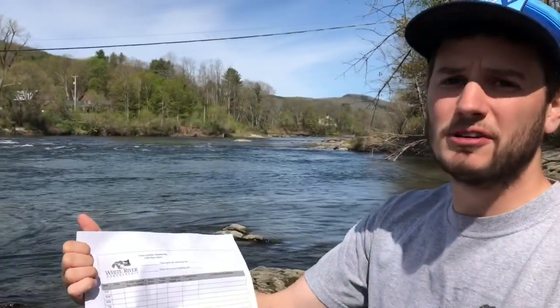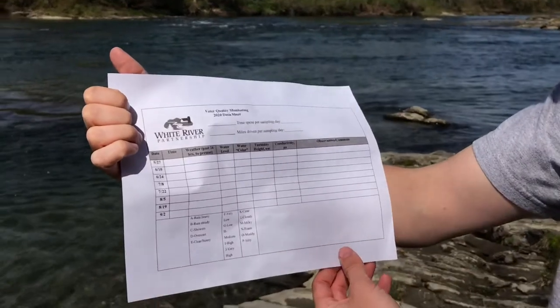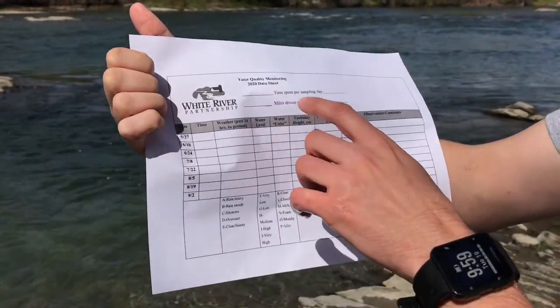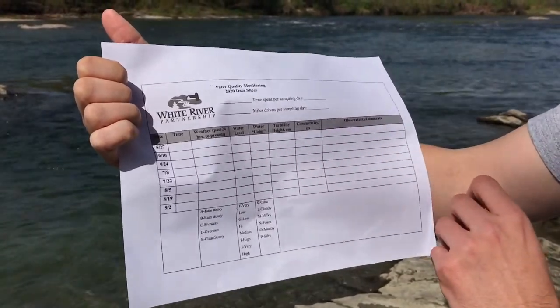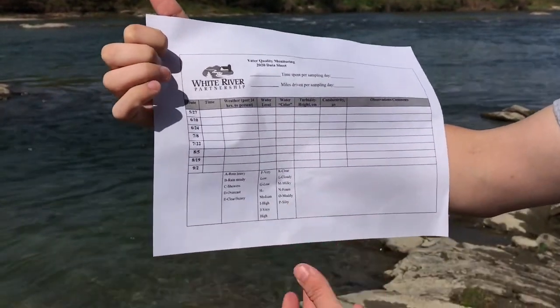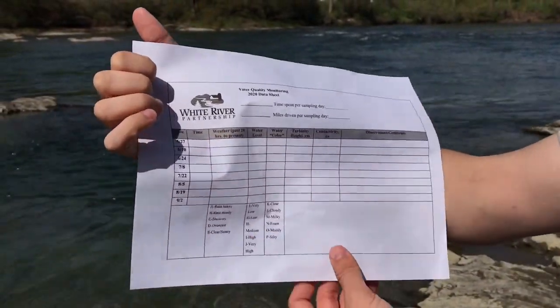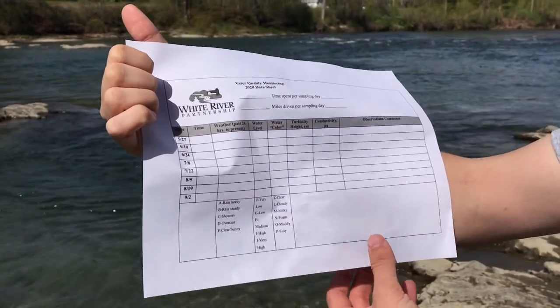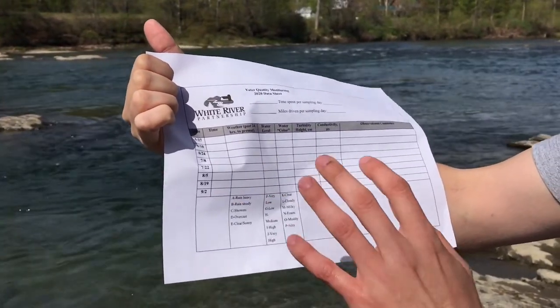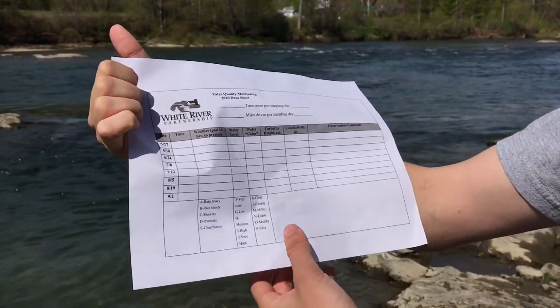The last thing you want to do before you leave your sampling spot is fill out your water quality monitoring data sheet. On it, we're going to ask you to estimate the time spent per sampling day and the miles driven per sampling day. And then you're going to fill out on each date the time that you took the sample, the weather in the past 24 hours to present, so you can make some notes if there's a lot of rain the day before, and then what the weather was like when you were actually sampling.